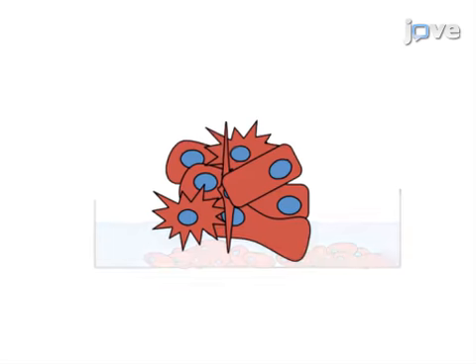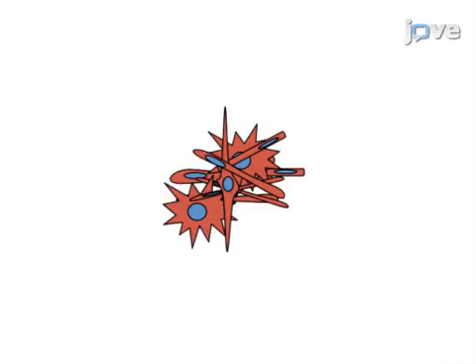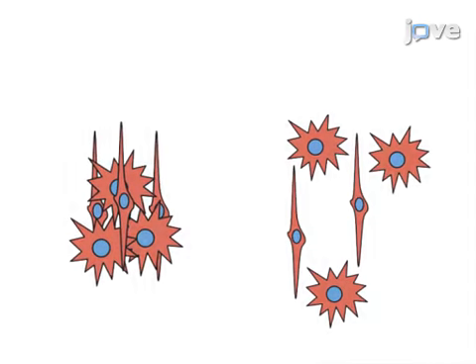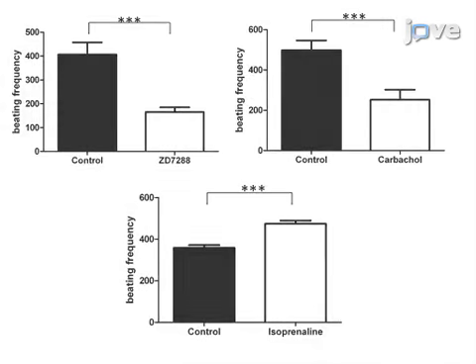Then the antibiotic selection is initiated and only cardiomyocytes survive. Finally, the cell layer is dissociated to obtain fast-beating single sinus nodal cells or small sinus nodal bodies. Ultimately, live cell imaging is used to show high beating frequencies of sinus nodal cells.